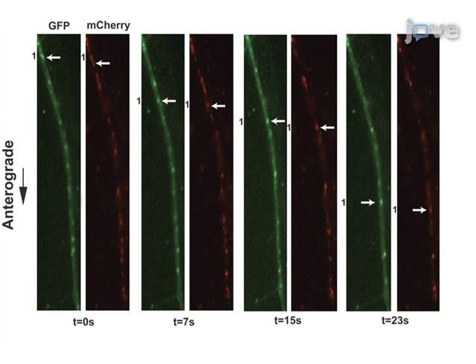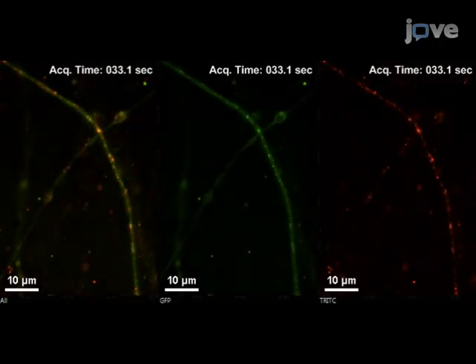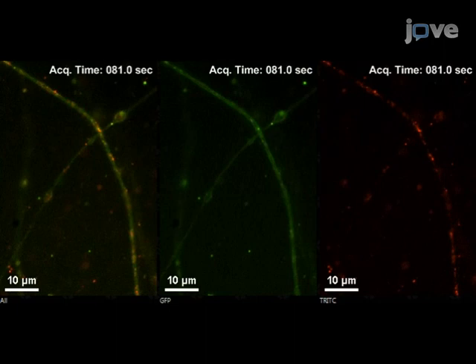The two fluorescent proteins are spatially offset due to the sequential acquisition of the fluorescent channels and the rapid movement of the viral structures. Application of this protocol to infections of dissociated SCG cultures with PRV348 has facilitated the visualization of the anterograde transport of virions.